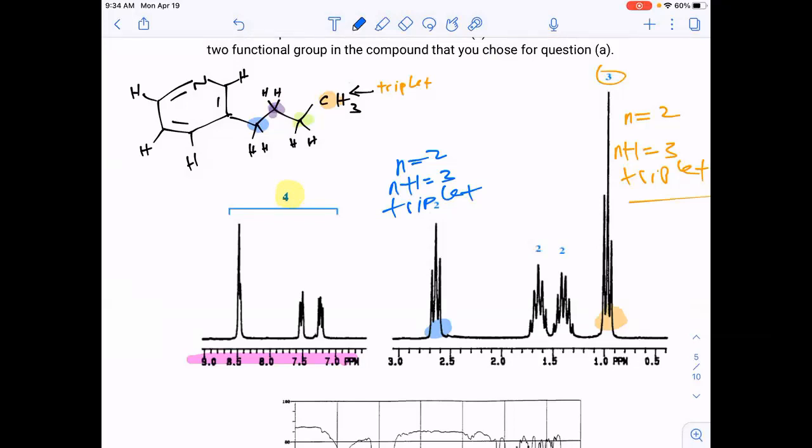Right, the one on the end has 2 neighbors, the orange set. The one next to that doesn't, because it's got 2 on one side and 3 on the other side. The purple one has 2 on each side, but the blue one only has 2 on the right side of it and nothing to the left of it. Are y'all following that? No.